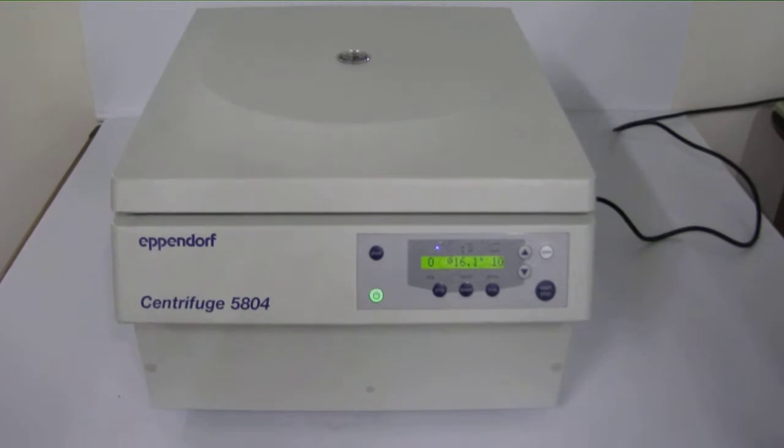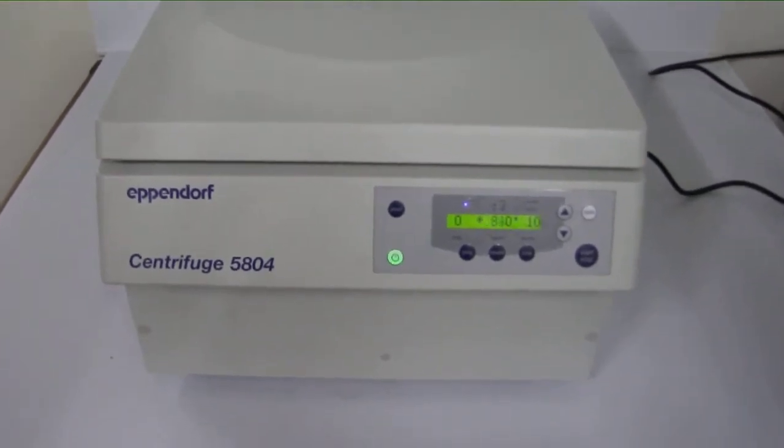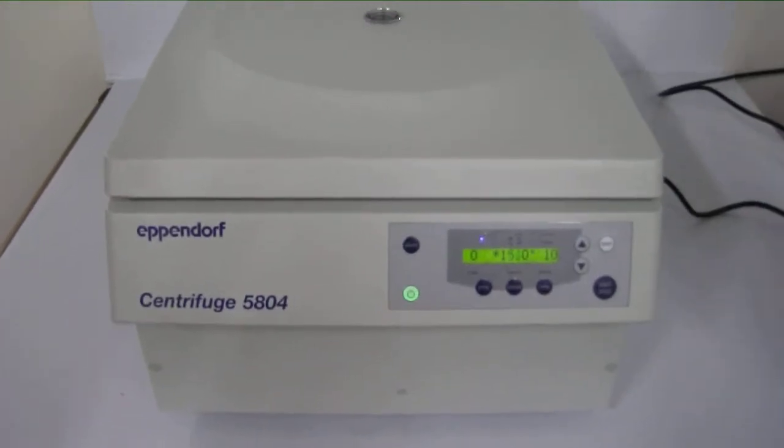The centrifuge allows for molecular applications in tubes up to 100 milliliters and can accommodate swing bucket, fixed angle, and plate rotors.